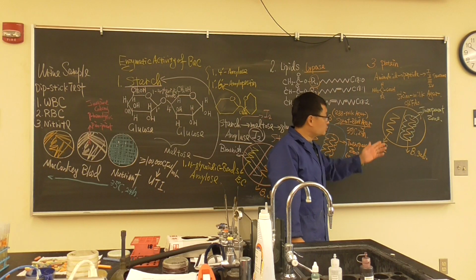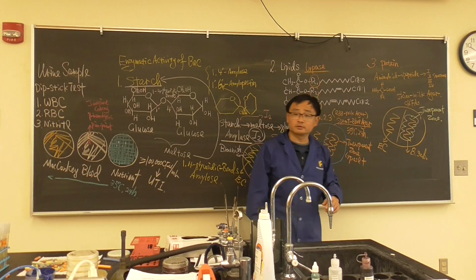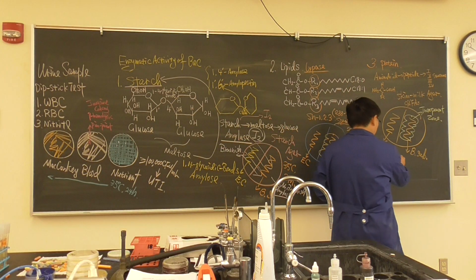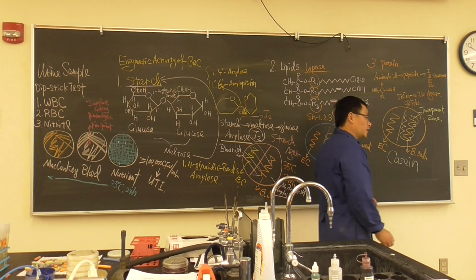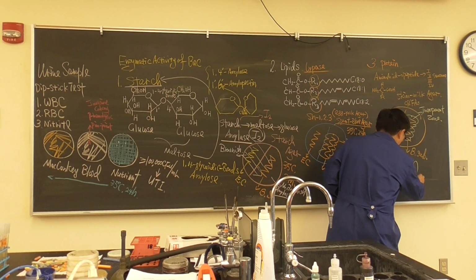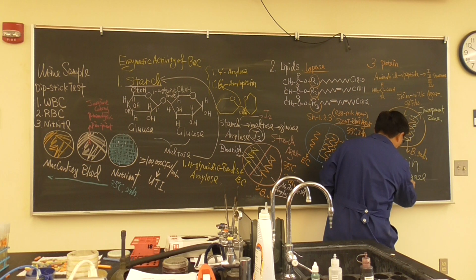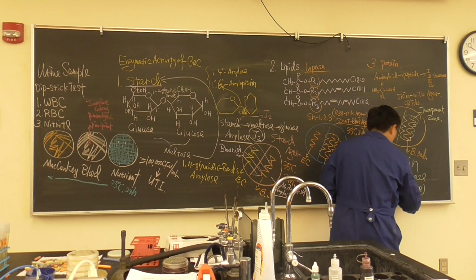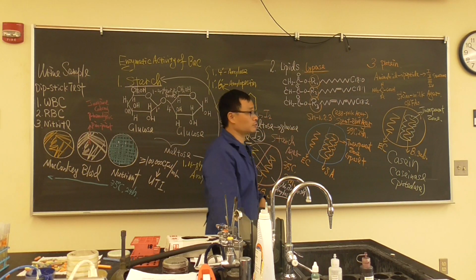By the way, what is the major protein in milk? Does anybody know? Maybe you know. Casein. So what's the enzyme for that? Caseinase. It is one of the components of protease. Okay, so that's what we have to do.